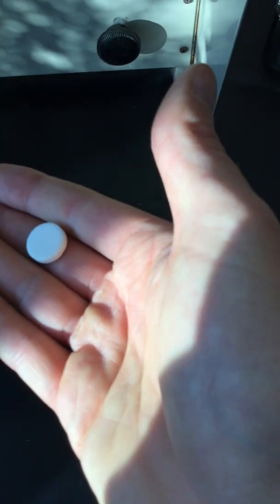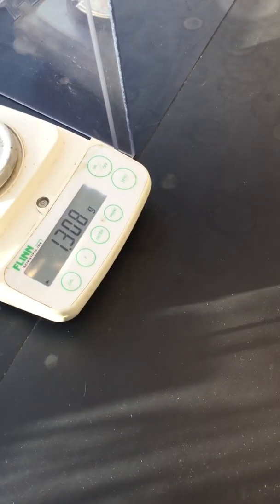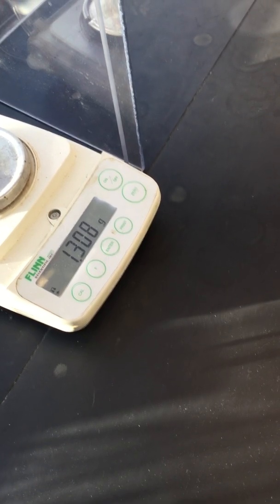Station 3 has Tums. Now these Tums are really, really old, so they probably give you more of a stomach ache than help. Here's my Tums. I'm going to throw this Tums on the balance as well. And when I do that, we get a mass of 1.308 grams.